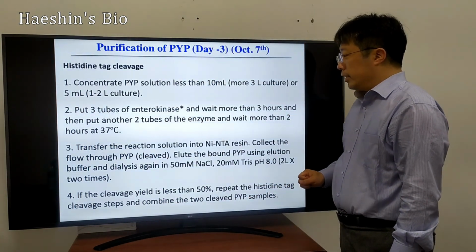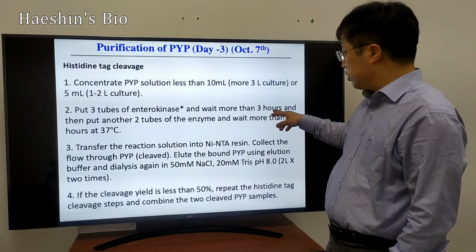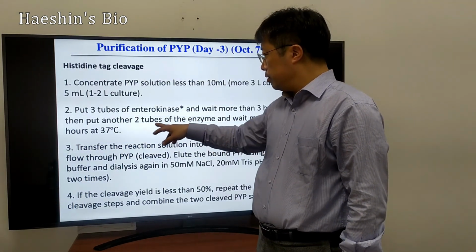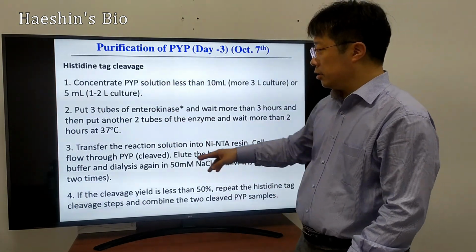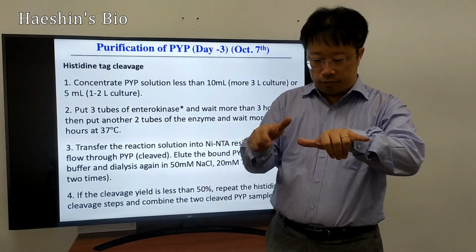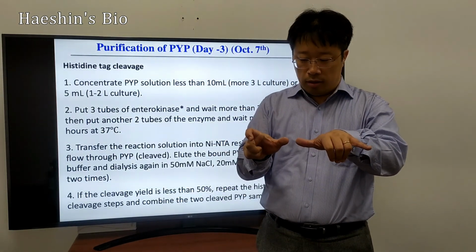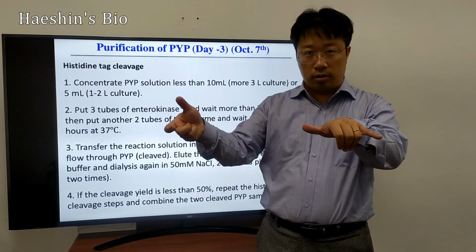Then you put enterokinase there, wait for 3 hours, and then put in additional enterokinase and wait at 37 degrees. Now this time the tag will be cleaved from the target protein.